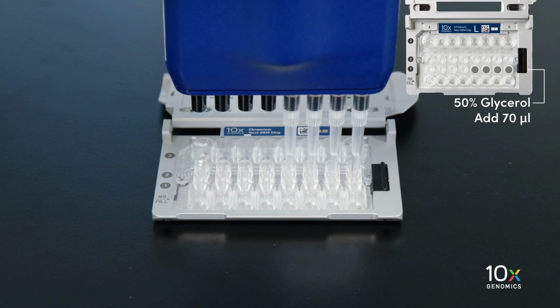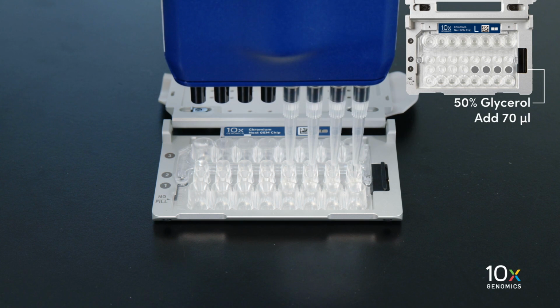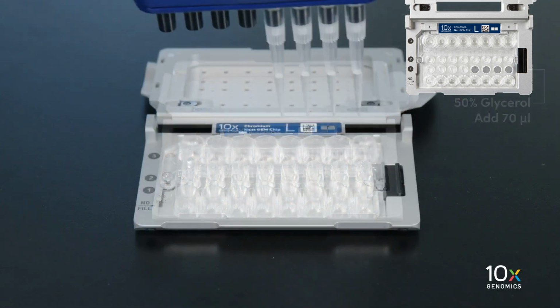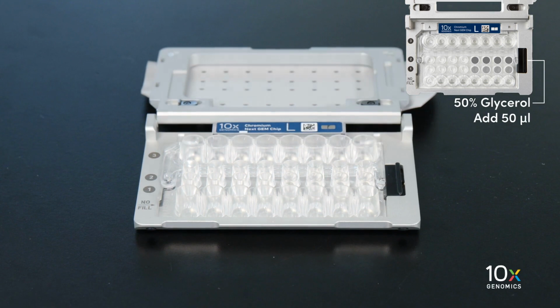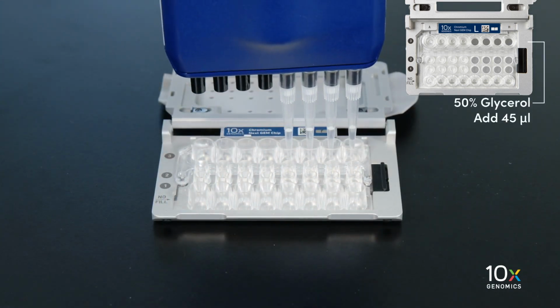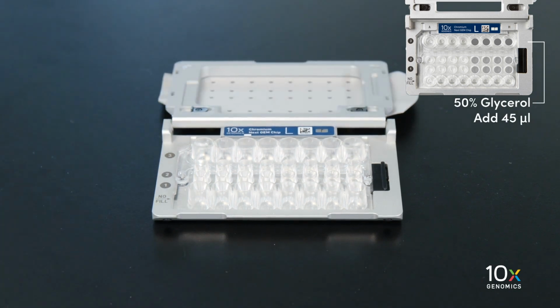When you pipette into the chip, gently touch the pipette tips on the bottom surface and slowly pull up the pipetter as you are dispensing. Next, we will add 50 microliters of 50% glycerol to unused wells in the row labeled 2. Finally, we will add 45 microliters of 50% glycerol to the unused wells in the row labeled 3.